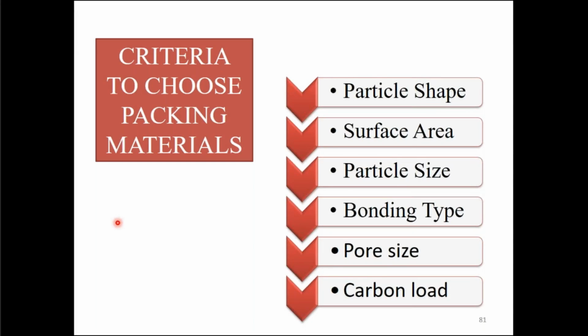Class, we have discussed the different types of columns. Main columns, particularly, could be analytical or preparative. Apart from the main column, you also have the pre-column and the guard column.